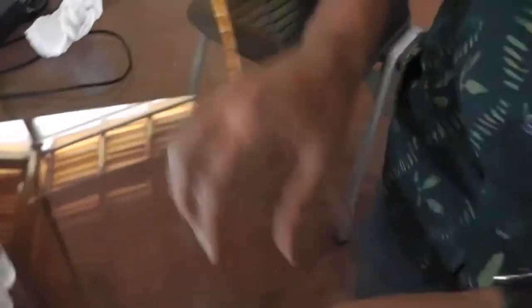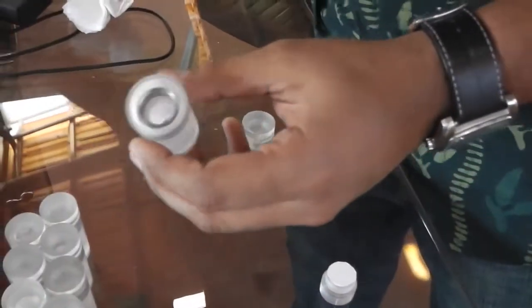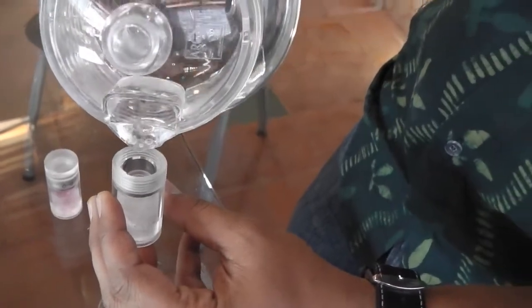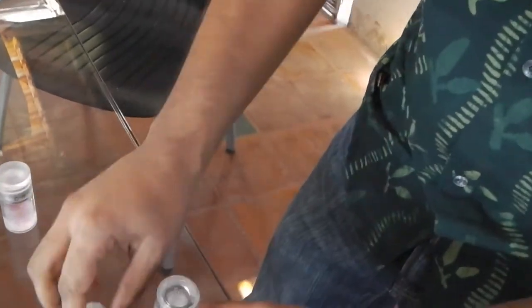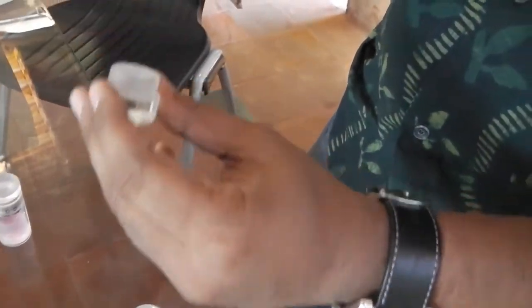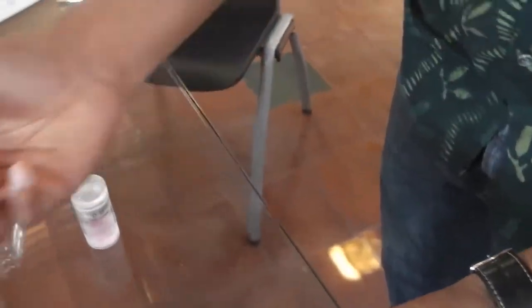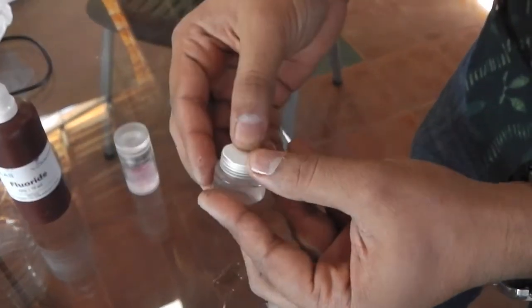Another important part of each test is the cartridge, where you actually fill in the sample. What you need to do is first fill in the sample — that's water. Then you have these capsules, which are filled with reagent, and you fit them into the lid of the cartridge.